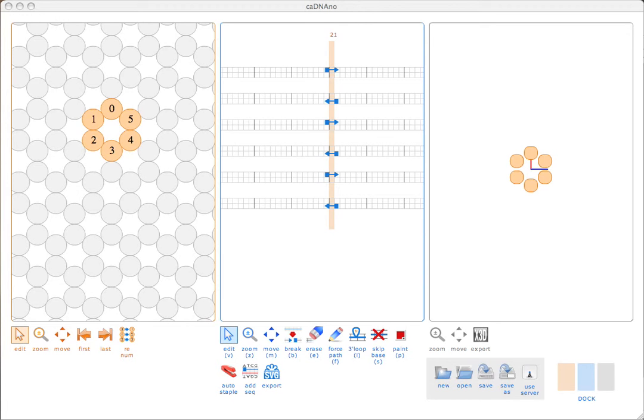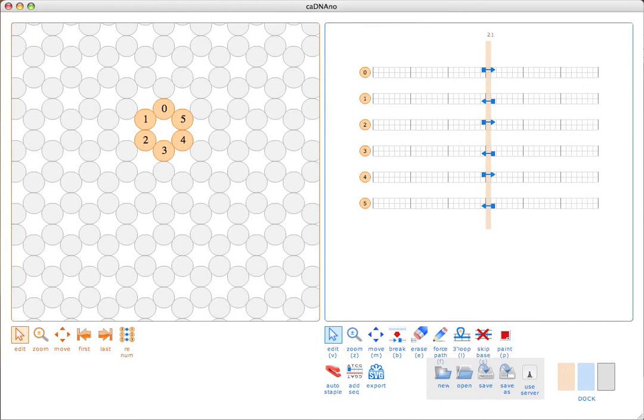The middle panel is the path panel. If the slice panel is a front view, you might think of this as an unrolled side view of your structure. This is where we spend most of the time routing scaffold and staple paths. The right panel is the 3D panel. I had this idea that providing a real-time 3D interface would make the 2D interfaces more intuitive.